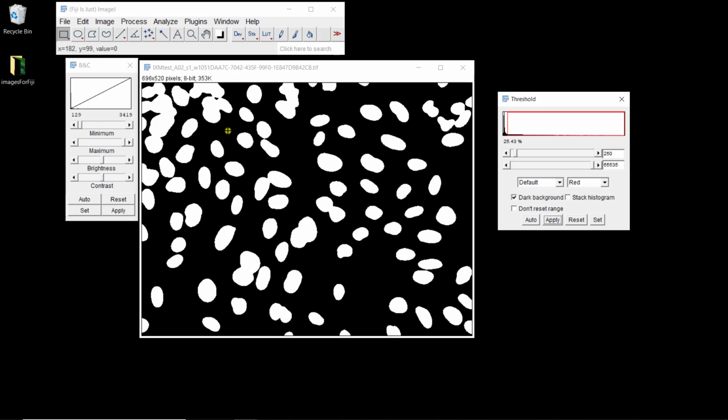And all the pixels that were above the threshold are now 255. Okay? So we identify the pixels that belong to the nuclei. And when the nuclei are isolated, it works fine. We can identify those nuclei, for example. But when nuclei are touching, like those two, instead of having two nuclei, we just have one main component, and we want to individually identify the nuclei.